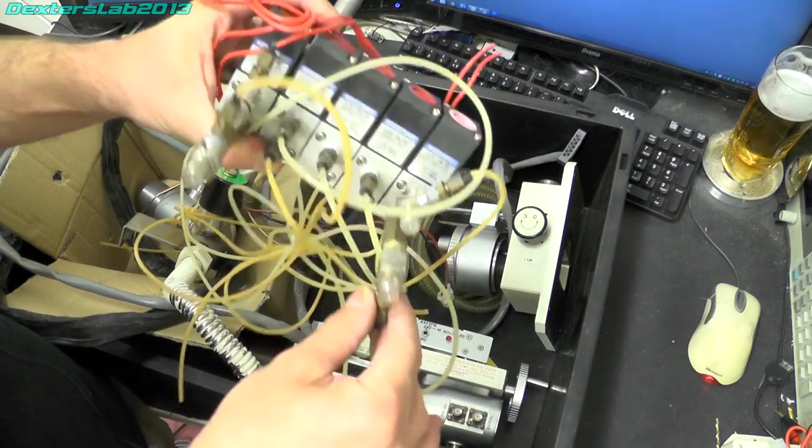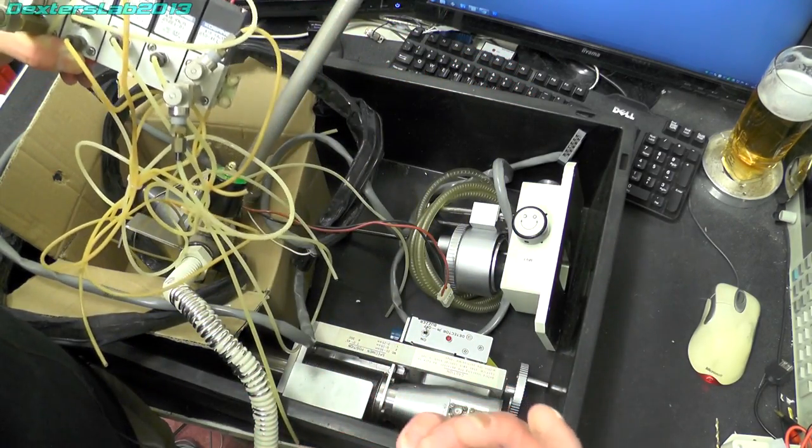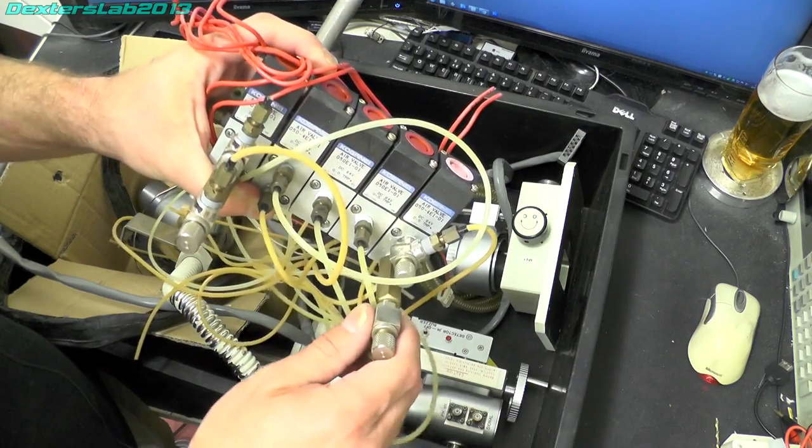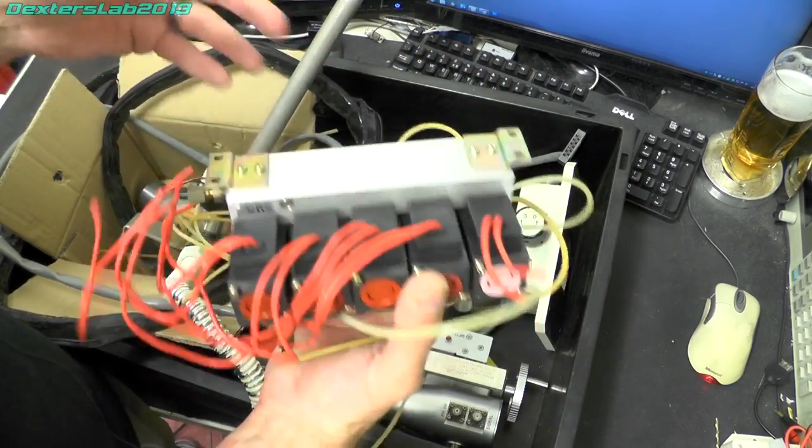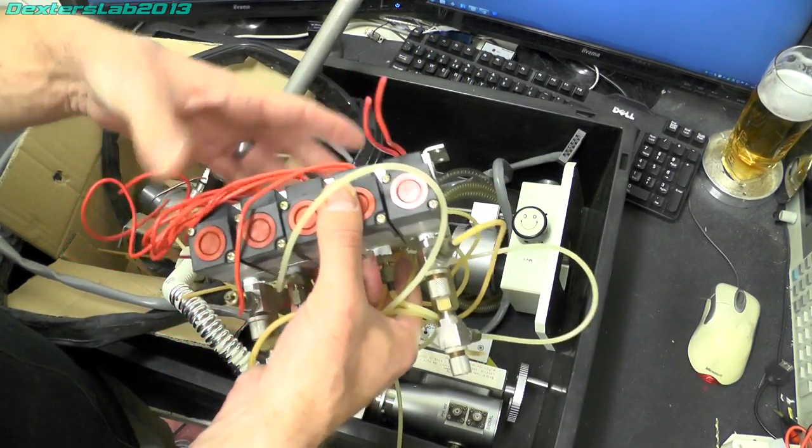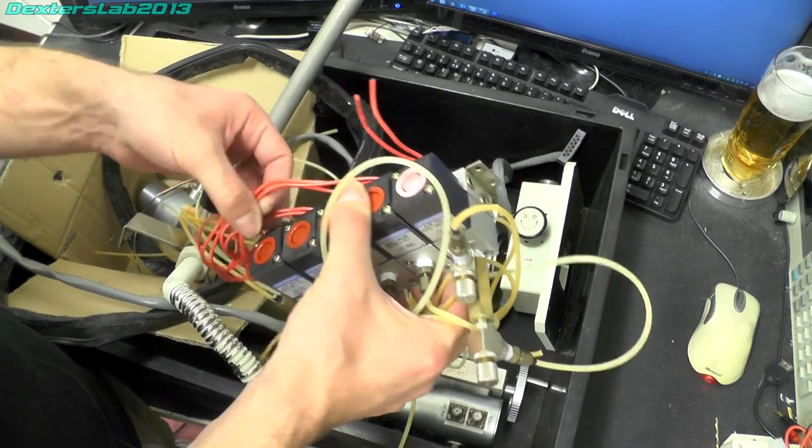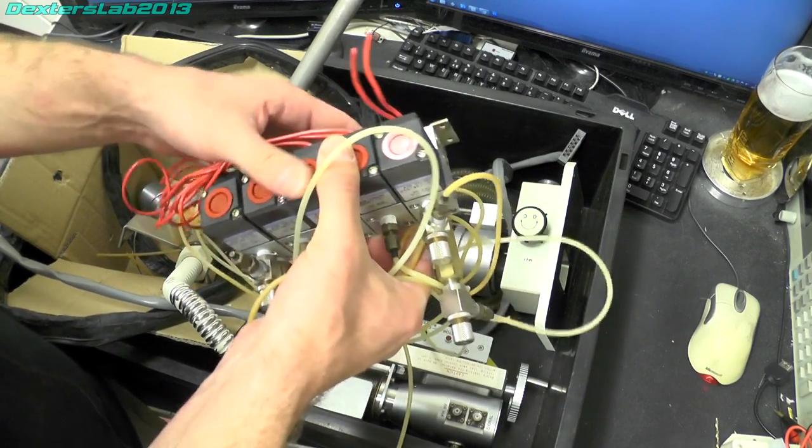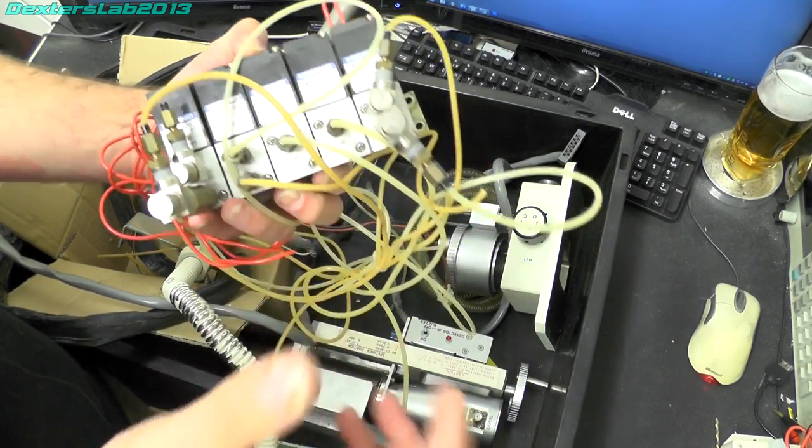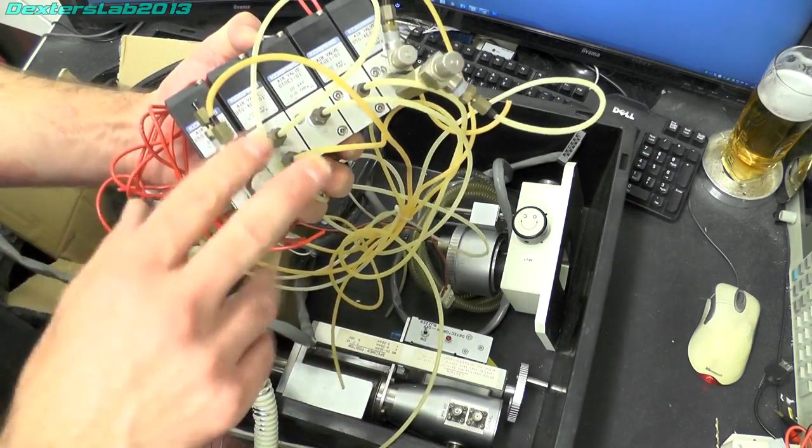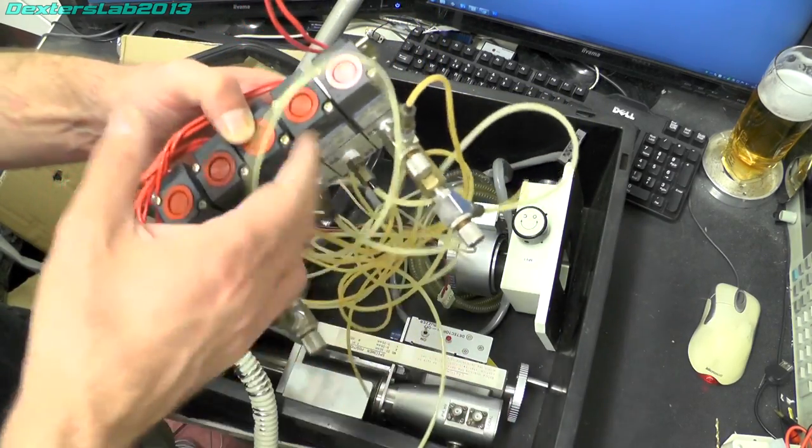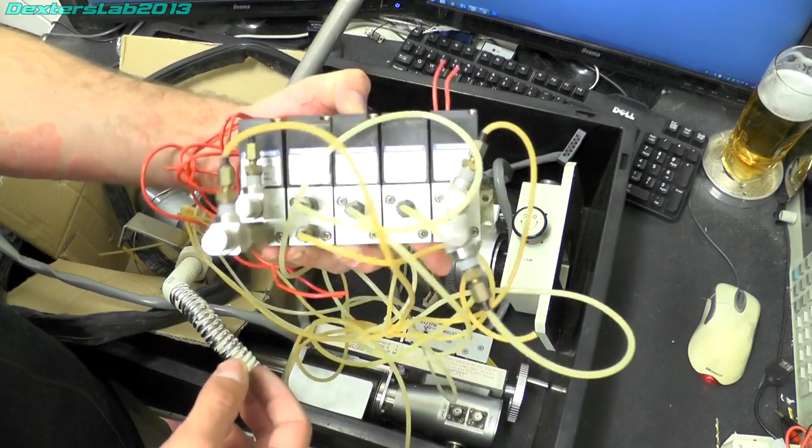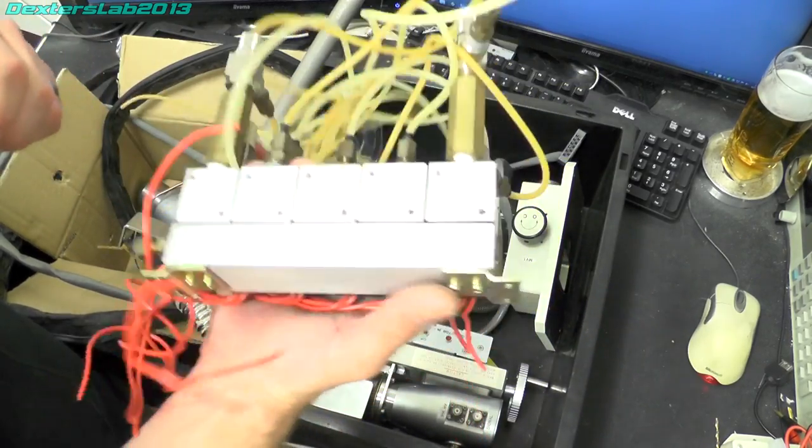This was running all of the pneumatic actuators and things like that. So I think this actually ran on compressed air so it wasn't vacuum, I think there was a separate system. But again the guy who has an identical system has asked me to save those so those will be heading off to him very soon.